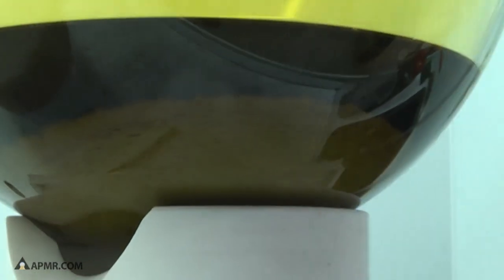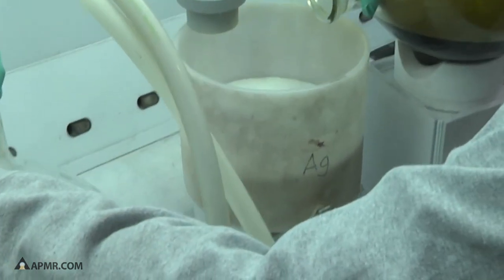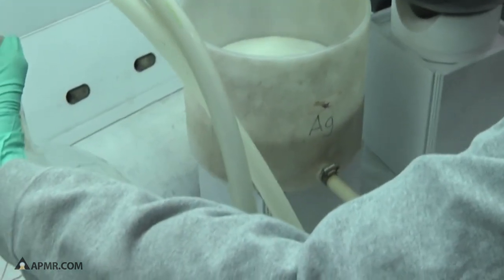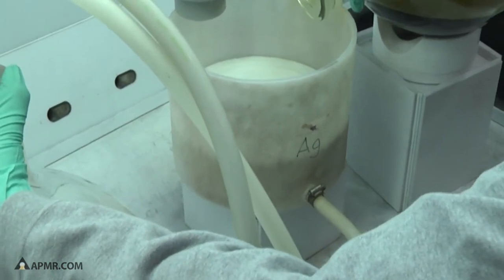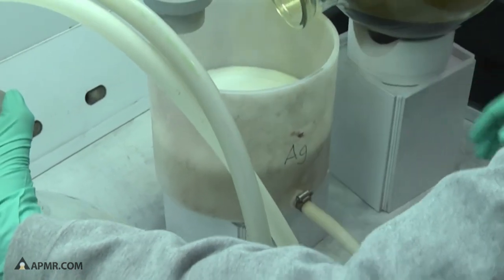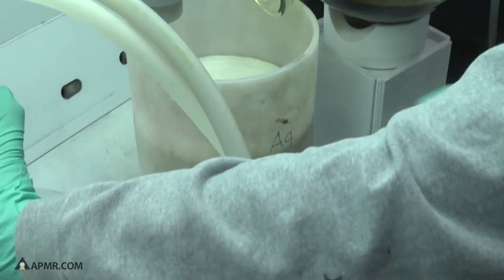This is what's going to pull the acid through the filter and into the next flask.